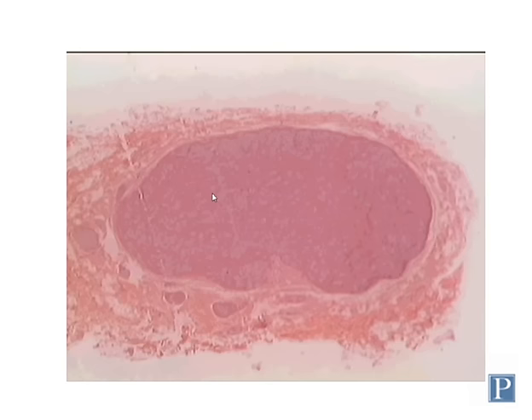This is a section of a different type of ganglion. This is a sympathetic ganglion, so these contain multipolar autonomic motor neurons rather than sensory neurons. But like the dorsal root ganglion, it's a large spherical collection of ganglion structures. This is frequently referred to as a paravertebral ganglion or sympathetic chain ganglia, because many of these ganglia are attached together in chain-like structures alongside the thoracic spinal cord.